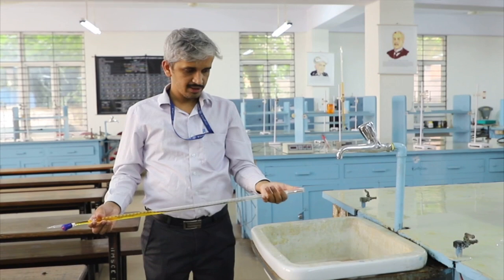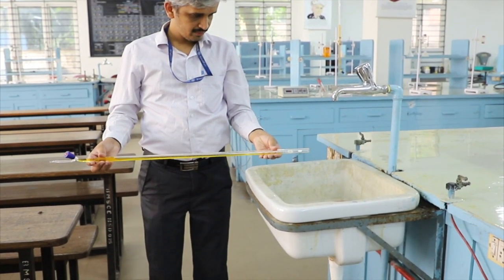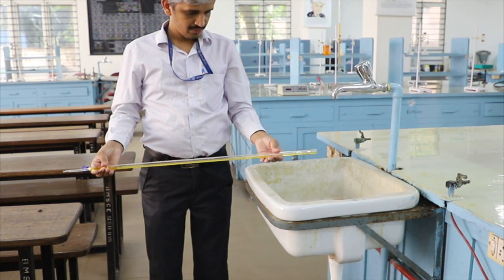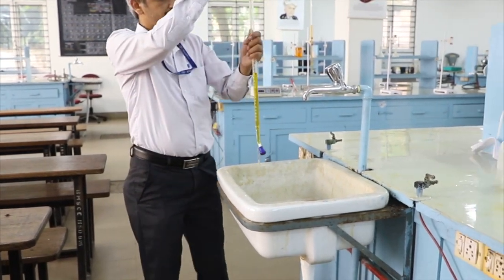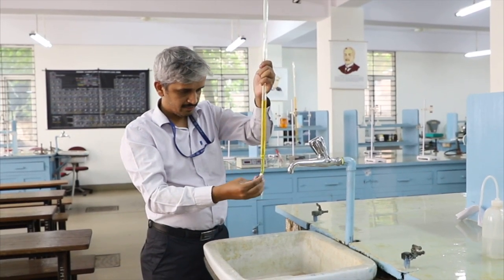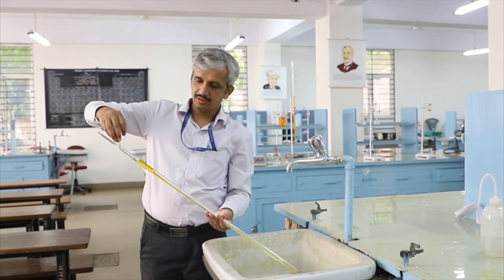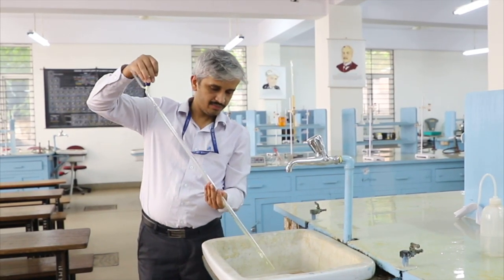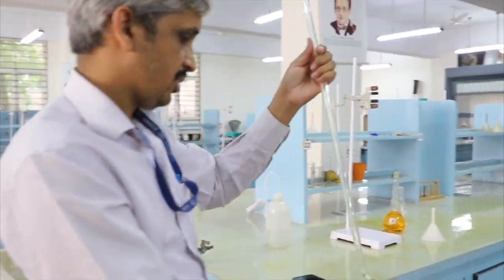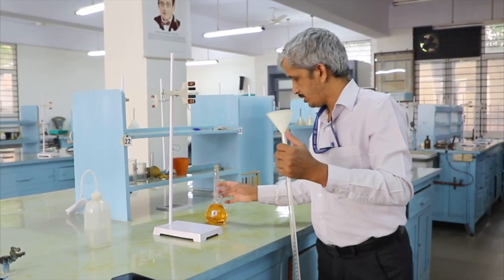Once again, I am not touching the solution with the hand. So here I am just holding like this. So all regions of the burette in this portion, everything is rinsed. Only here the tip of the burette should be rinsed now. Okay, that is also done. Now you can discard the solution. Now you can refill the burette. Fill the burette with the solution to be taken.